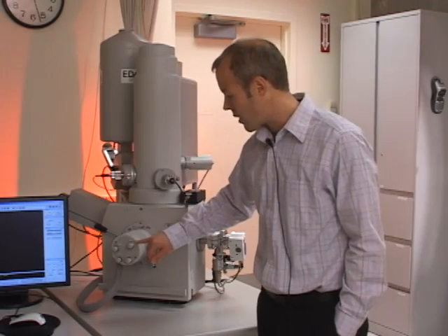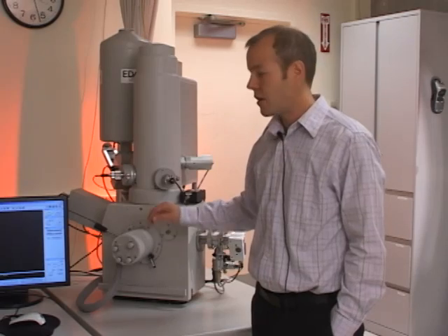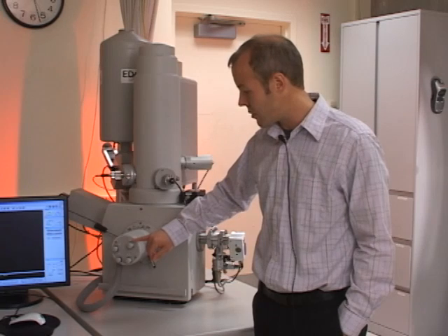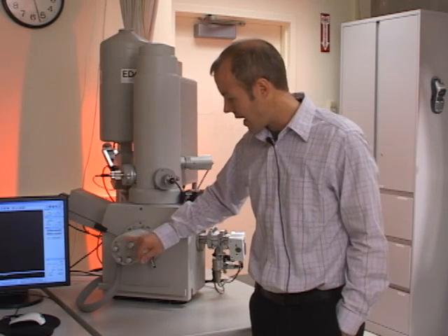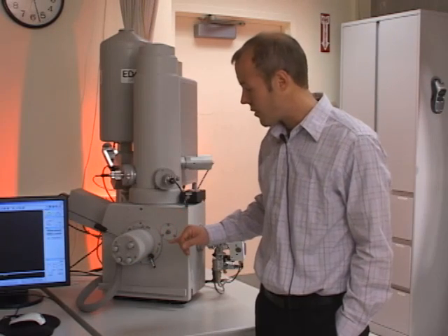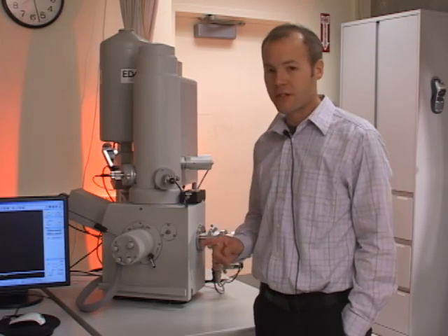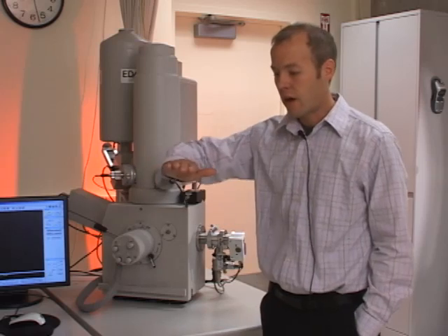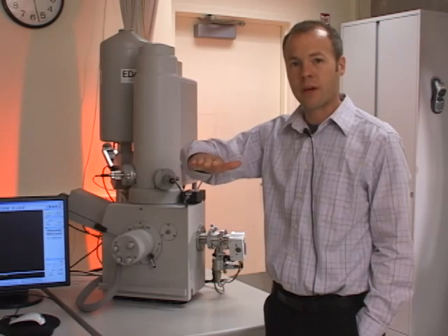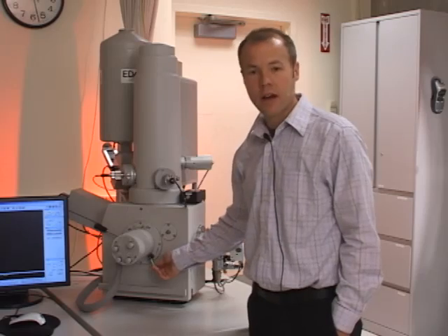The knobs on the front of the door are manual stage adjustments. You can also adjust the stage through the software. The stage knobs are labeled Y, X, R for rotation, and Z for height in the counterclockwise direction — all motorized and controllable through software. The one manual adjustment is tilt: the sample can be tilted up to 45 degrees using this handle and stage lock on the front of the door.